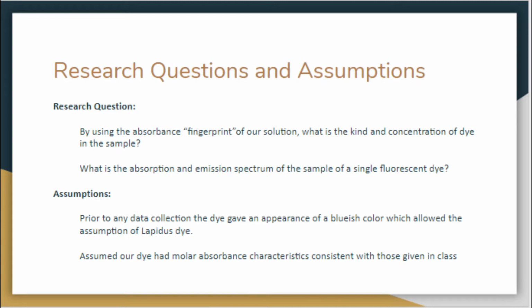Some assumptions that we had prior to any data collection: the dye gave an appearance of a bluish color, which allowed the assumption of Lapidus dye. And we assumed our dye had molar absorptivity characteristics consistent with those given in class.